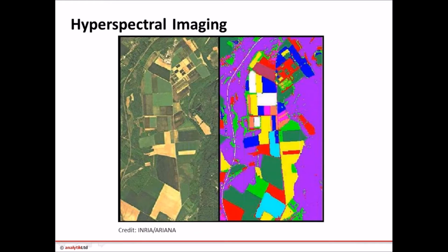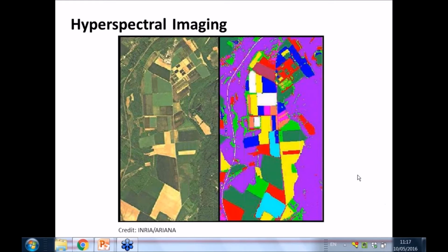So this, for example, could be very useful to the military for finding camouflaged tanks, things that might look invisible to our eyes because it's a certain shade of green, but in the hypercube and the processing, you can actually highlight and find whatever's in there.